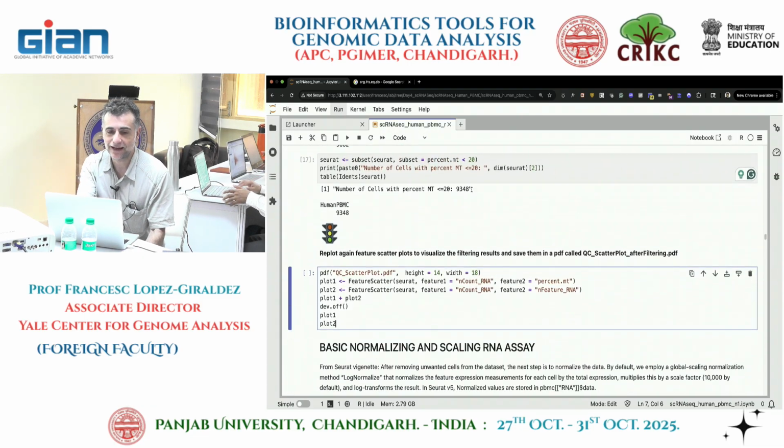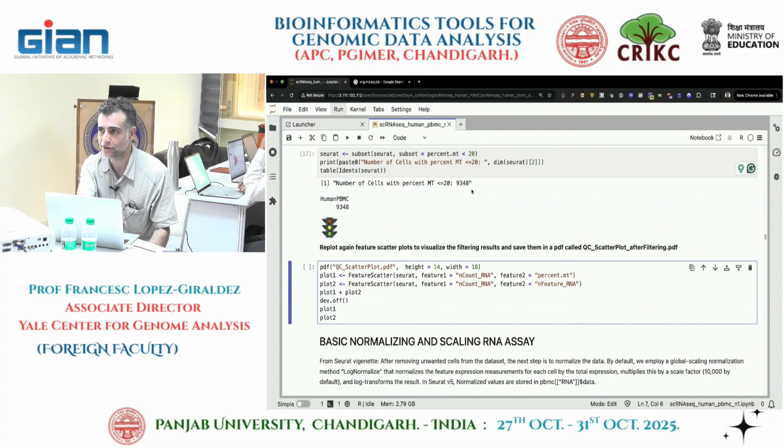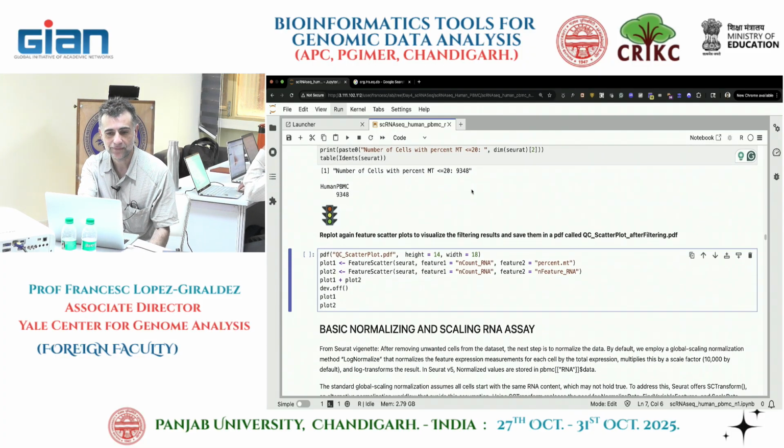Sorry, I didn't. I mean, if you want to be safe, you could have created another object and then... But it's a bit dangerous to keep creating objects because they are big memory hoggers. I don't know, maybe. By the way, this is probably cleaner.